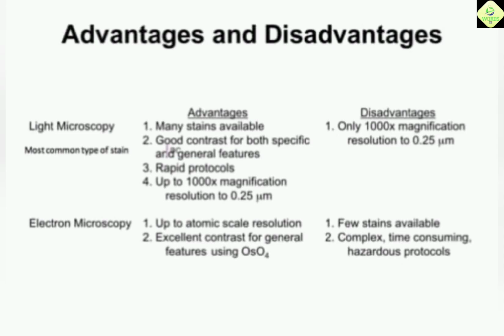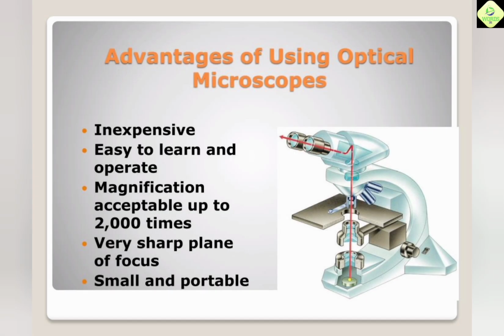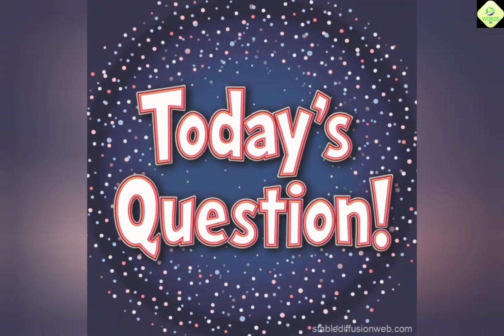In electronics, inspecting printed circuit boards and small electronic components. In geology, studying rocks, minerals, and fossils. In education, demonstrating microscopic observation in schools and colleges.